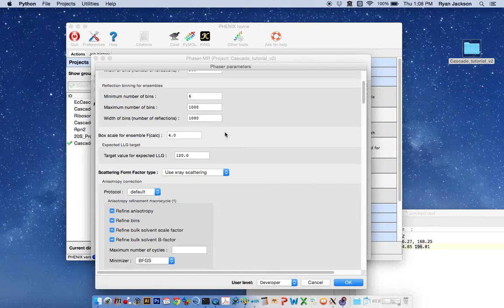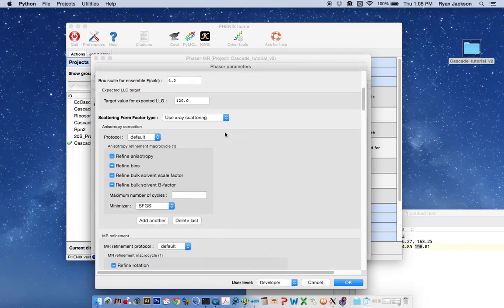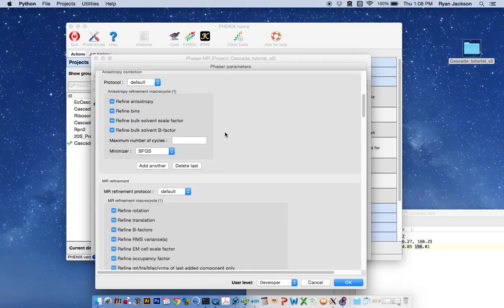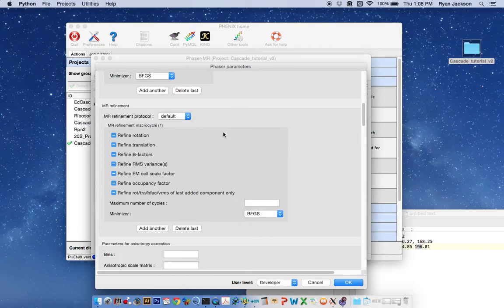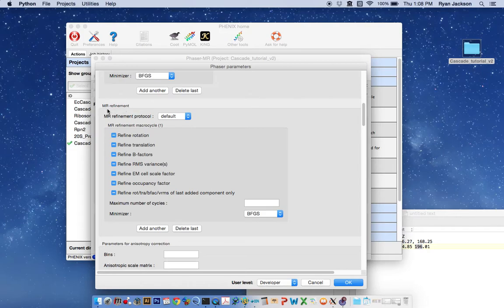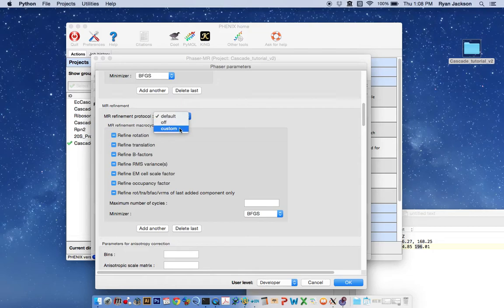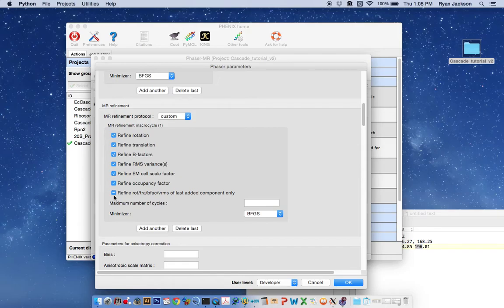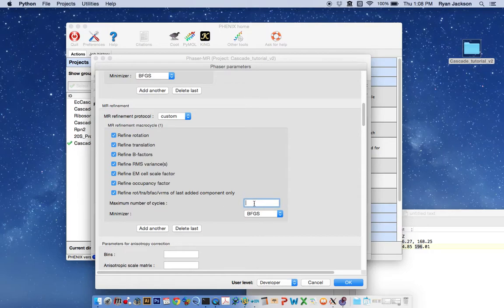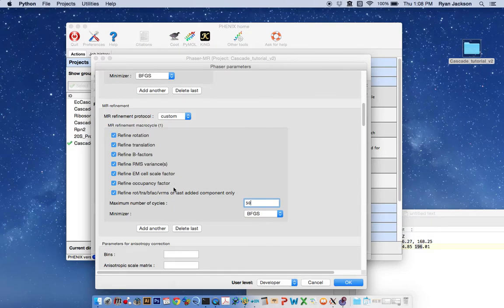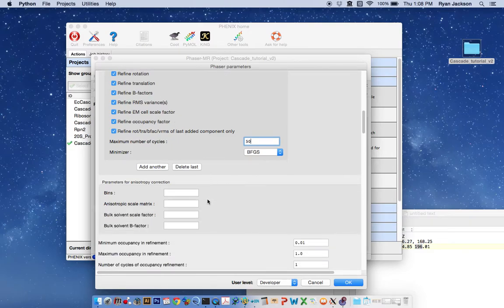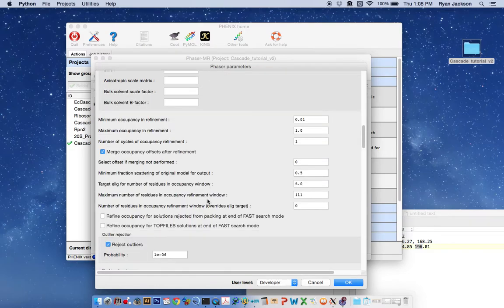You want to find this section for tools, MR Refinement, and you want to change this to custom, and you want to turn all of these on. Especially you want to turn on refine EM cell scale factor. And the maximum number of cycles we'll put as 50. So this will account for any magnification errors in the EM map.